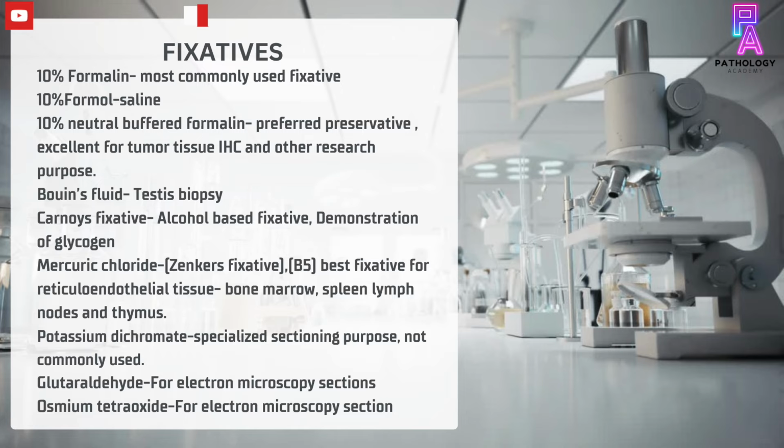Other fixatives are potassium dichromate fixatives, which are used for specialized sectioning purposes. Glutaraldehyde, which is used for electron microscopy sections. Osmium tetroxide, which is again used for electron microscopy sections.